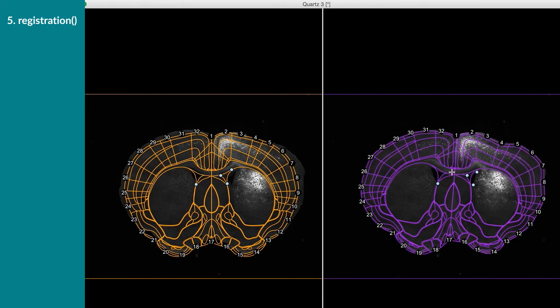So I'm going to make a triangular shape here of the ventricles, and then add the two sides of the ventricles here, because they're a little bit larger in my target image. So here, and that is here in the atlas, and on the other side as well, and here, and we do it for the other ventricle as well. So there, and there, and the last one.